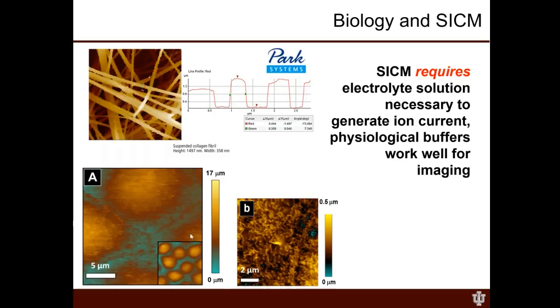This image on the bottom is an image taken from my research group. This is a layer of epithelial cells. In the epithelial cells shown here, we make electrochemical measurements. Here's a cell body, here's another cell body, and you can see here's the junction between cells. And so we've zoomed in here. You can zoom out and see this layer of cells easier. But if you zoom in even further, we can see, for instance, the microvilli, these small finger-like projections that extend at the surface of this cell layer.